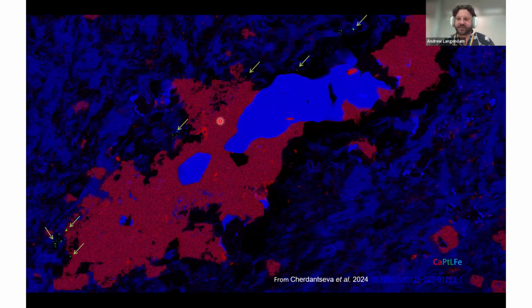And this is one of the fastest scans that we do. We scan at 2 microns resolution, and we normally dwell for half a millisecond or less. So that means that we're scanning very, very quickly. We can cover these very large areas. And every time the beam goes across one of these platinum group element nuggets, it lights up like a Christmas tree. The Maya detector can see it very well, and then we can focus in on that particular nugget and get a much higher resolution map of that area.